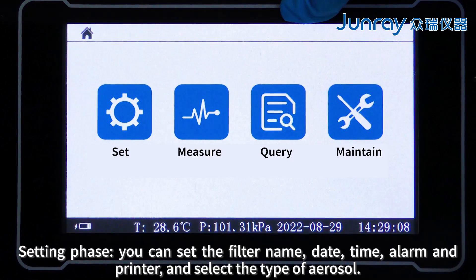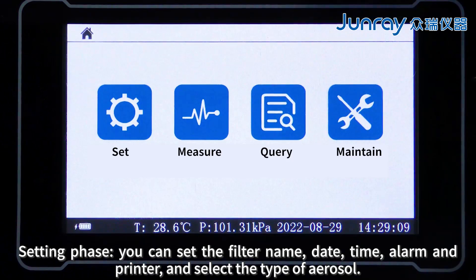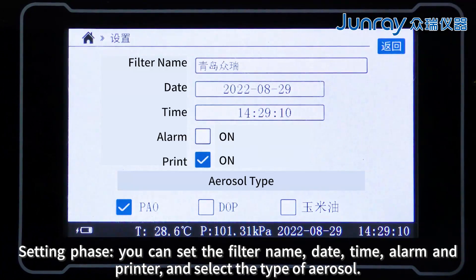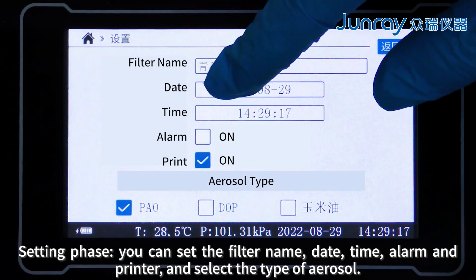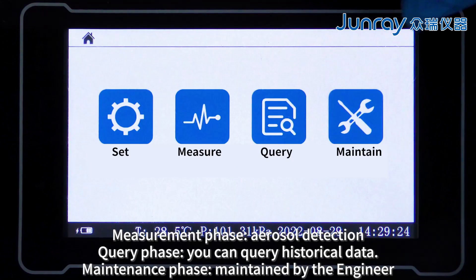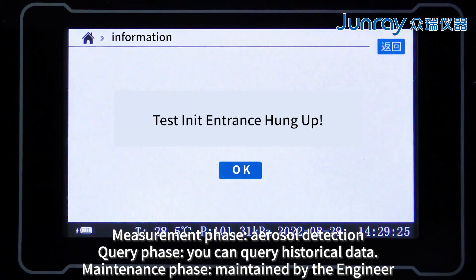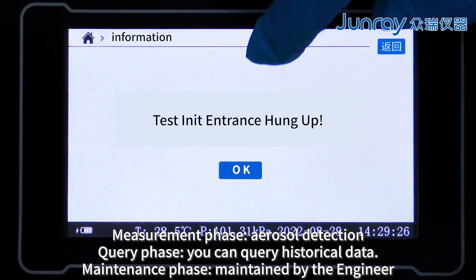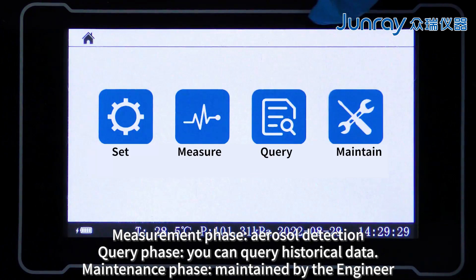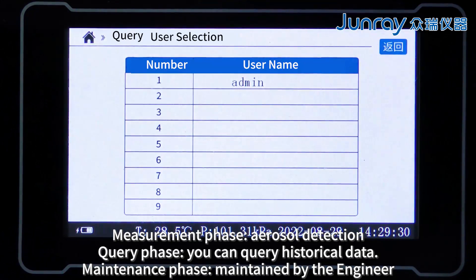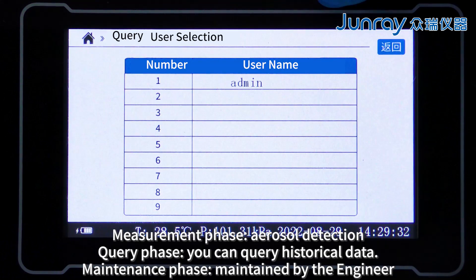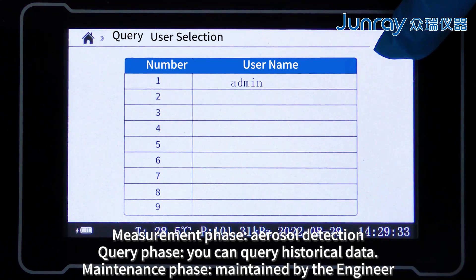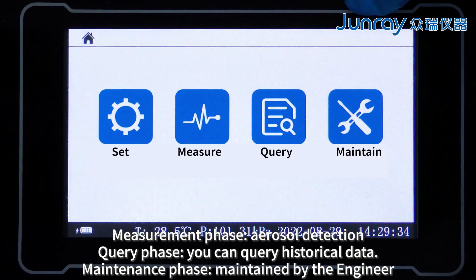In the setting phase, you can set the filter name, date, time, alarm, and printer, and select the type of aerosol. In the measurement phase, you perform aerosol detection. In the query phase, you can query historical data. The maintenance phase is maintained by the engineer.